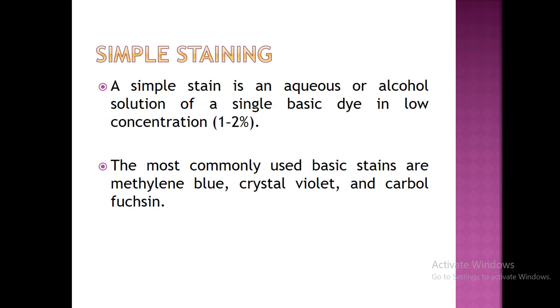This stain is usually an aqueous or alcoholic solution of a basic dye. The important thing is the stain used in the simple staining technique is basic in nature. It means it possesses a positive charge, and the charge on the bacterial cell wall is negative.